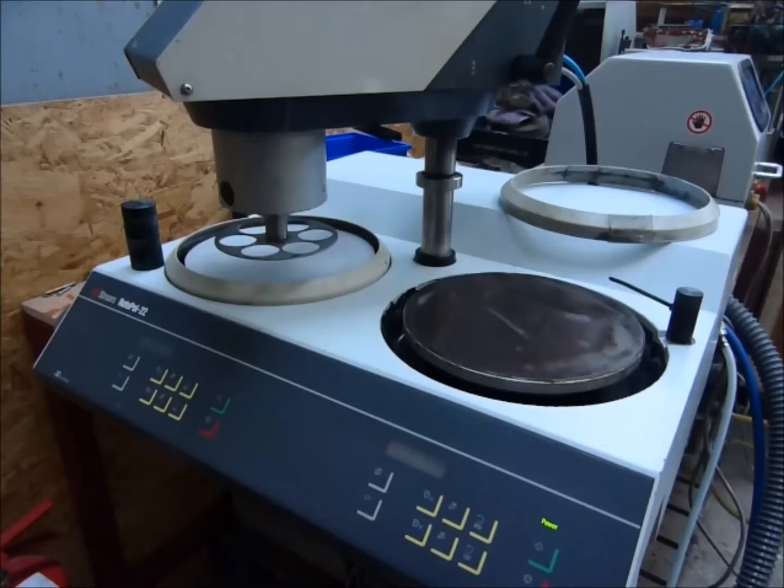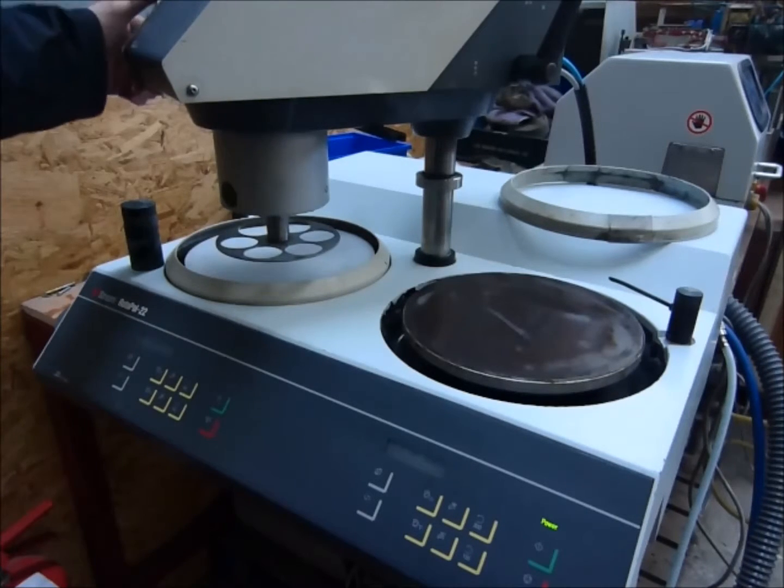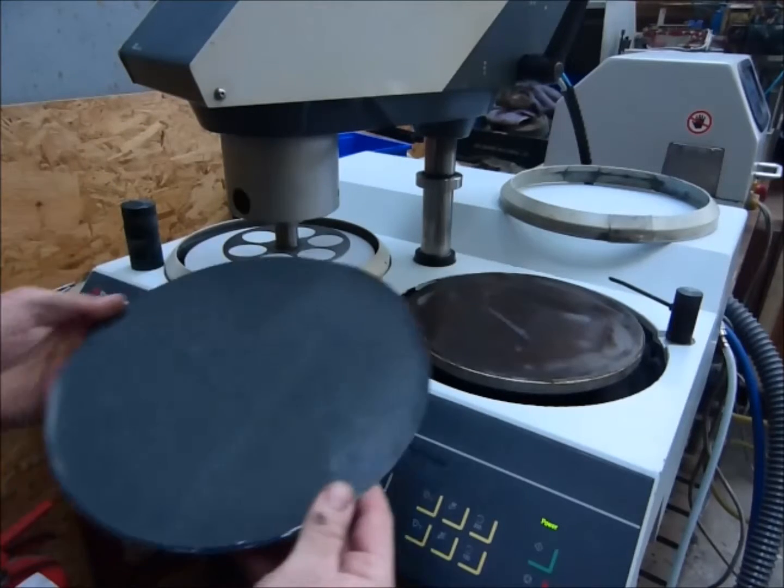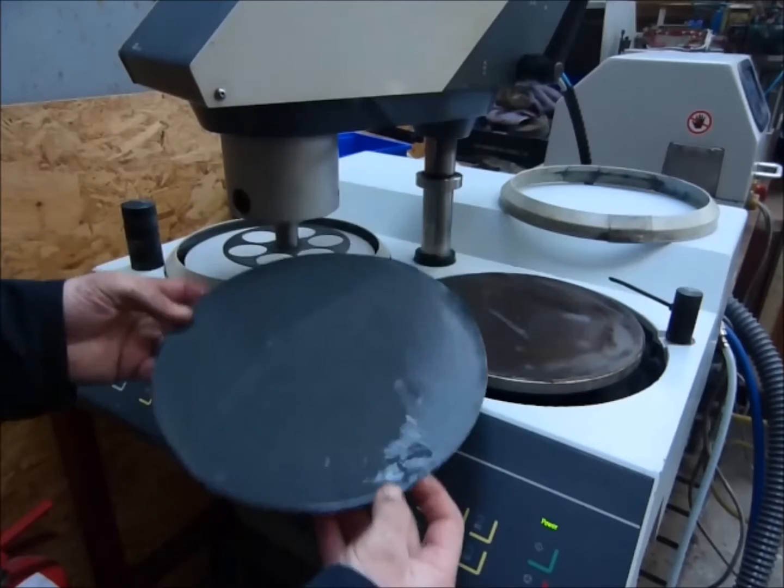This is a quick video on how to use the RotorPole 22 with the RotorForce forehead. We're going to do grinding using the grip fix system.